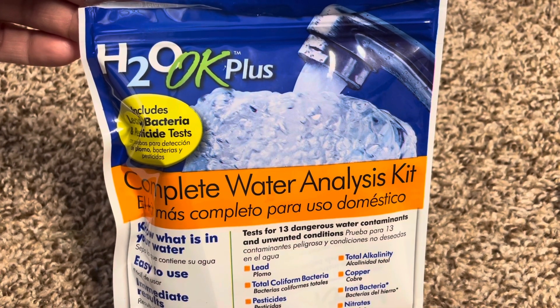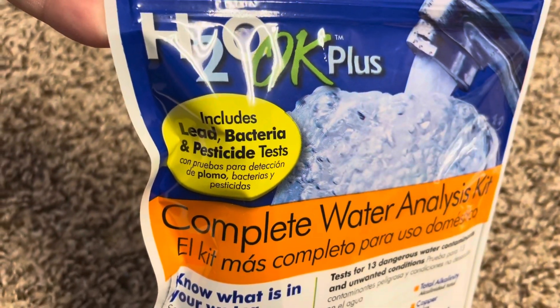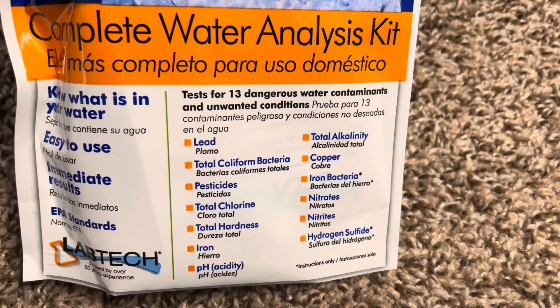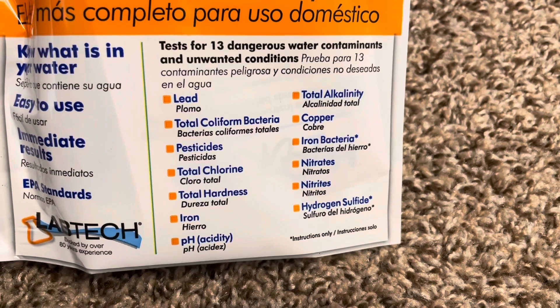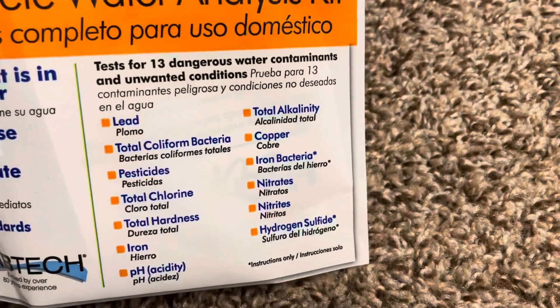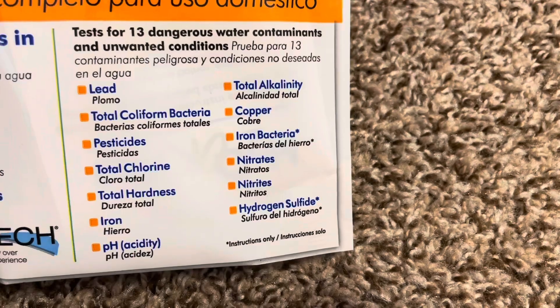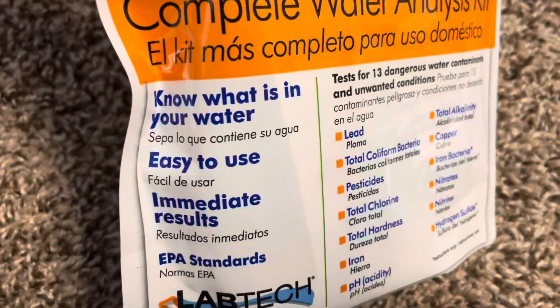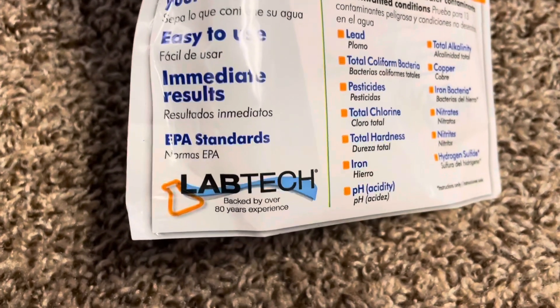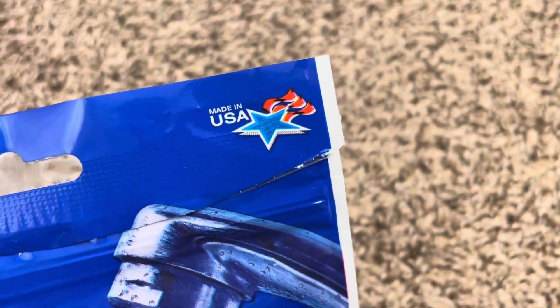Hey everyone, I'm going to be showing you the H2O OK Plus Complete Water Analysis Kit. You can see here it includes lead, bacteria, and pesticide tests. This tests for 13 dangerous water contaminants and unwanted conditions: lead, total coliform bacteria, pesticides, total chlorine, total hardness, iron, pH acidity, total alkalinity, copper, iron bacteria, nitrates, nitrites, and hydrogen sulfide. On the side it says: know what is in your water, easy to use, immediate results, EPA standards by Lab Tech, backed by over 80 years experience, made in USA.